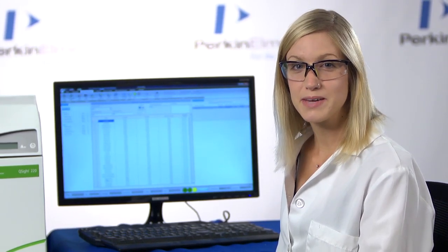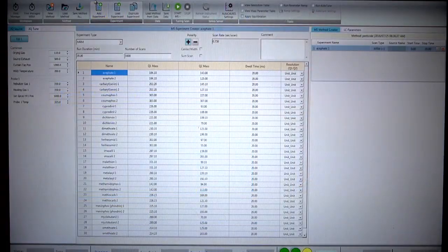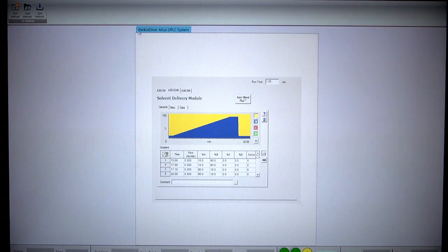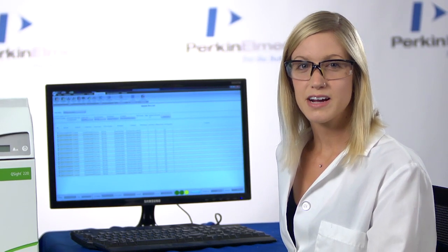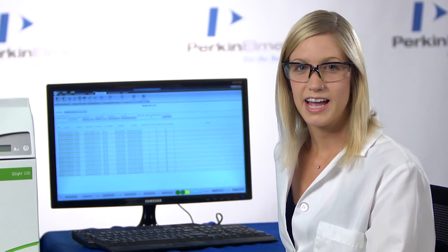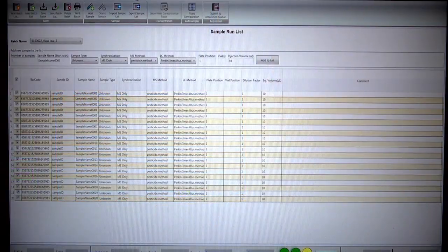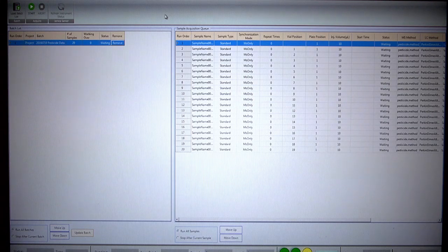After we complete the MassSpec method, we will then create the LC method. Once that is complete, we can create our batch with the BatchListCreator and then submit the list to the acquisition queue. Next, we simply start the acquisition, and now our method is running.